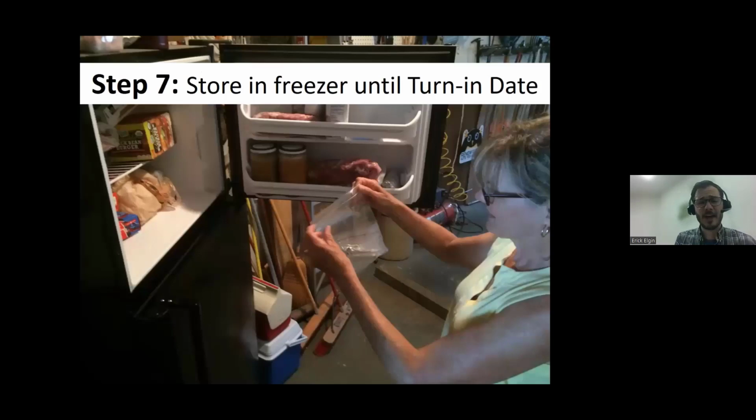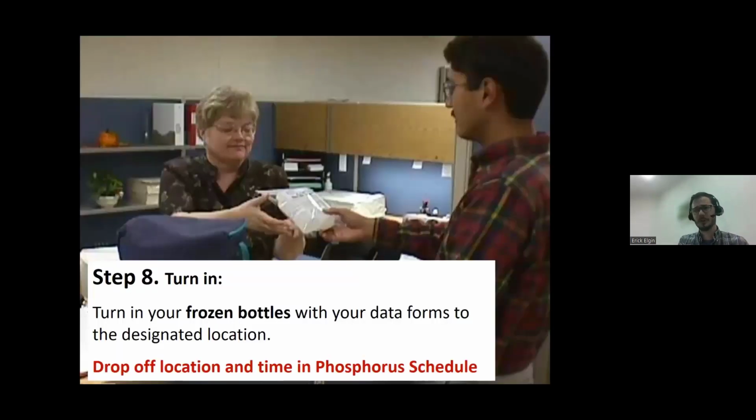Step 7, you now have everything. You're back at your house. Please store in the freezer until your turn-in date. So for spring, that is quite a ways. You may have collected in March, and please keep it in your freezer until the June date. And for your summer sample, that won't be very long at all in your freezer. And then that ends with turning your frozen bottles with your data forms in to the designated location on the phosphorus schedule. So that's that earlier document that I showed.